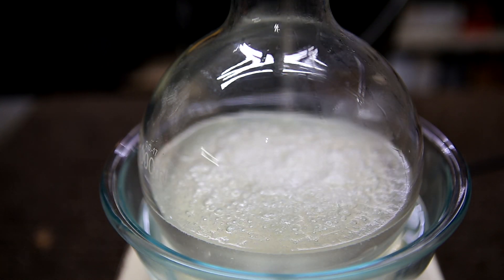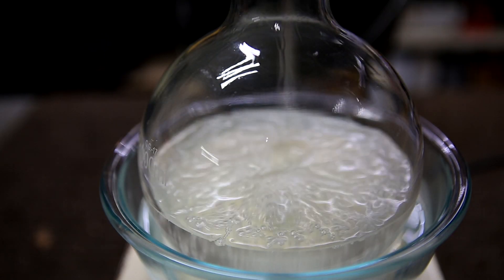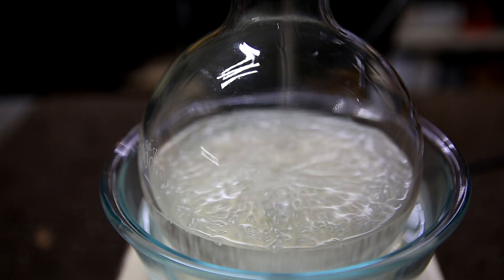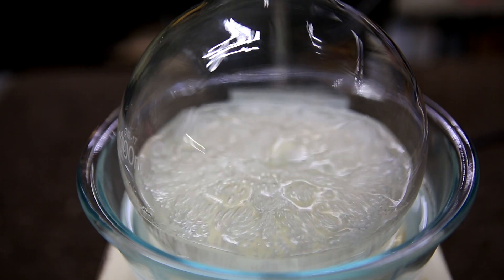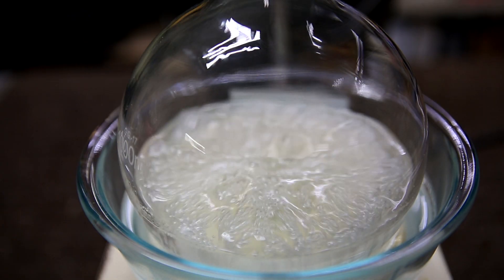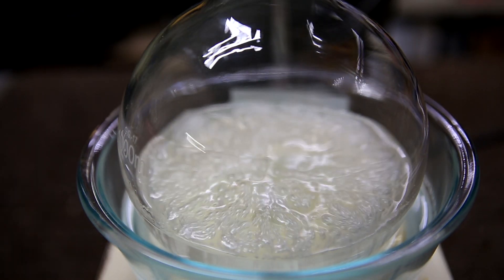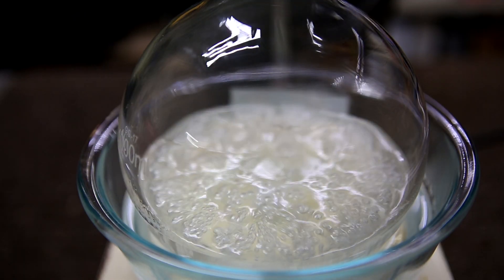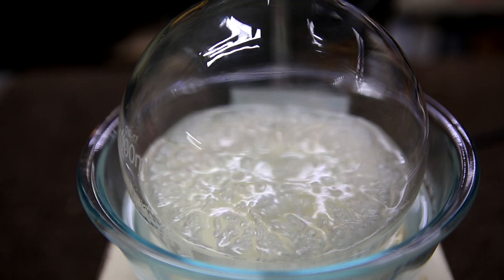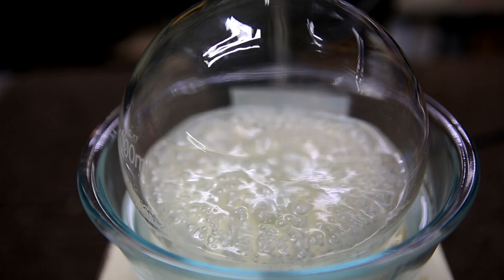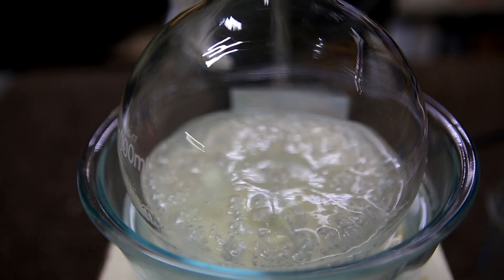Methylene chloride boils at 39.6 degrees Celsius, so it's going to be the first fraction that comes off. It is important to note that methylene chloride and methanol form an azeotrope at around 93% DCM and 7% methanol. In my mixture, the second lowest boiling point fraction that would come off is methanol which boils at around 60 degrees Celsius.